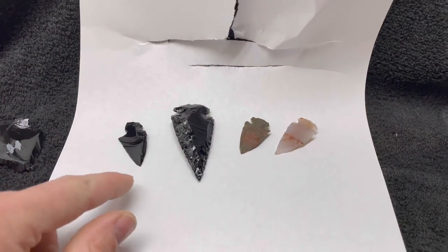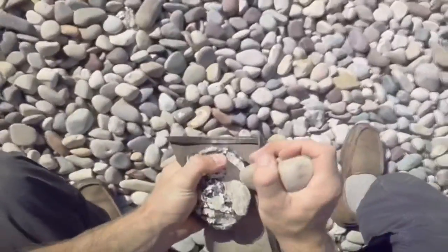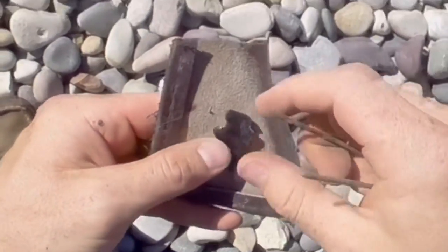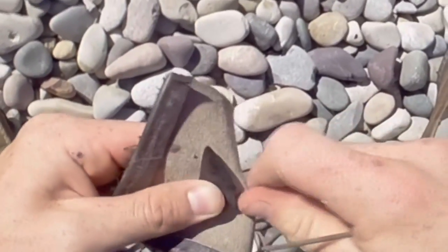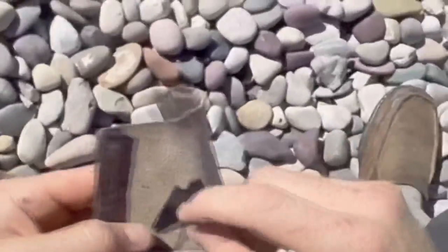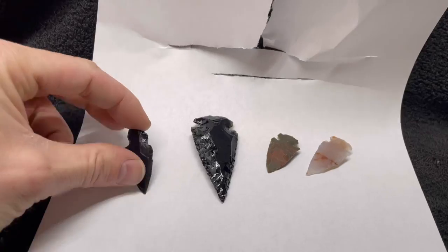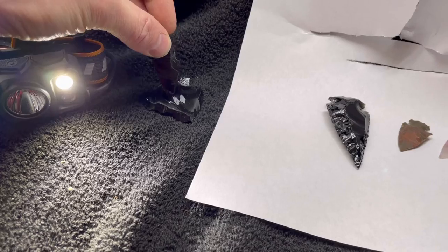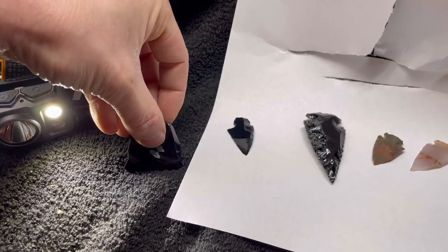Now don't worry, these are not antiques. They were made very recently using traditional techniques by my friend Joseph from Good and Basic. I have a few different kinds. So this is black obsidian, you can see the light does not go through it very well. It's actually a snowflake black. I have another piece of it here with the snowflakes there. I will try to dissolve a piece of this to see what it does to the actual snowflake portions.